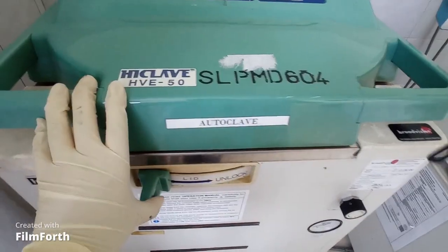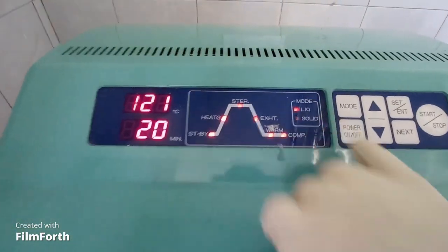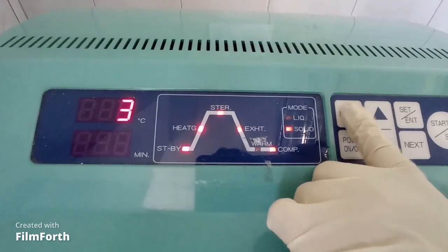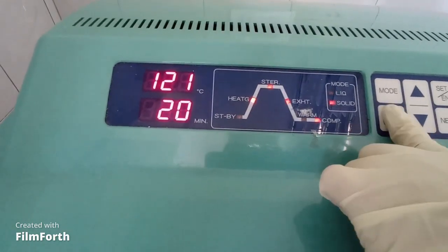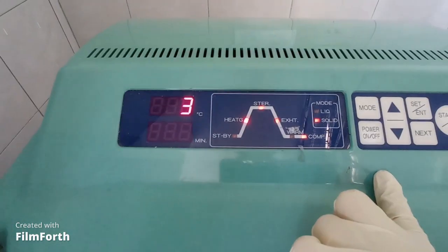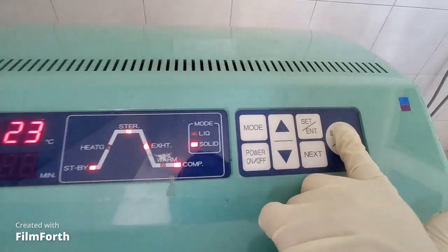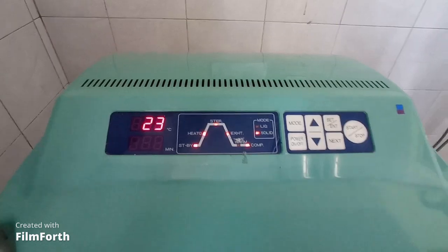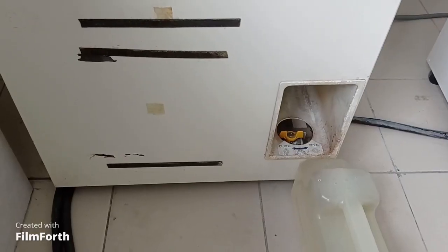Now I'm closing the machine. You have to make sure the lid is locked properly. The machine was already set on liquid mode, so I will change the mode to solid because the clinical waste is solid. The temperature and time are already set: 121 degrees Celsius for 20 minutes. The machine is set, so I will start it and leave it for about 1 hour and 30 minutes.